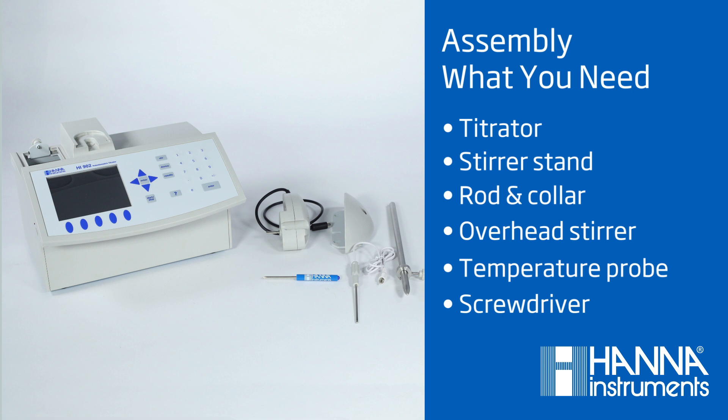If you've decided to assemble the titrator yourself, let's go over the basic assembly of this unit. First, you'll need the titrator, your stirrer stand and rod, the overhead stirrer and collar, a temperature probe, and a screwdriver.